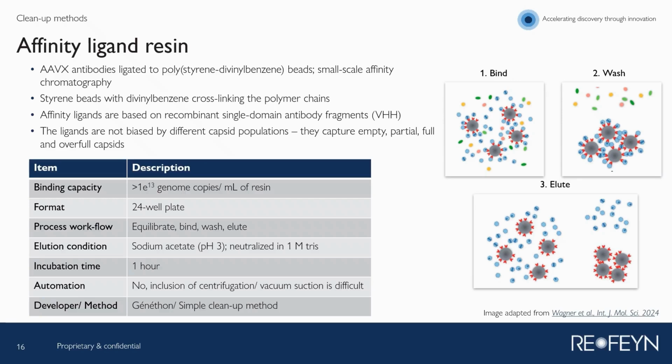As highlighted, this protocol requires an incubation time of about an hour, and automation is difficult, especially because it requires centrifugation or vacuum suction to be incorporated into the automated workflow. So now let's look at some data generated using this protocol by our industry partners.